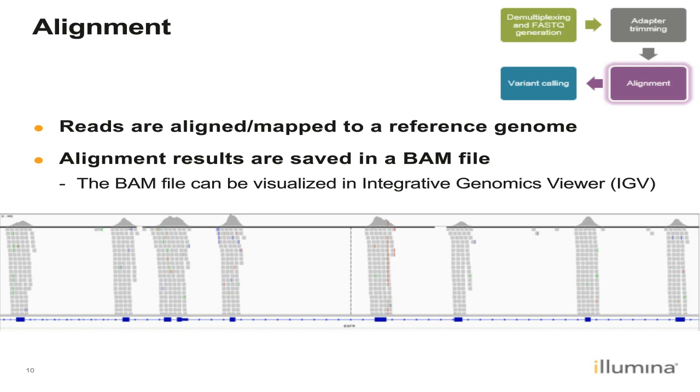And at the very top track, we see the gray mountains, and those are just giving us a summary of our read pileups over those regions. And this is a typical output we would expect for an enrichment because the probes specifically pulled down the exon regions for sequencing.